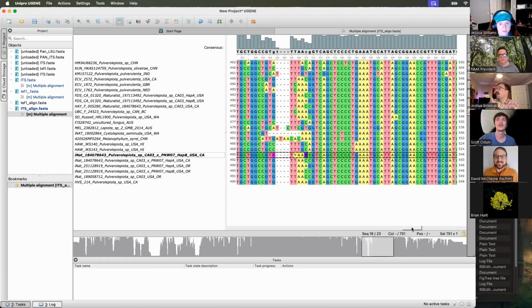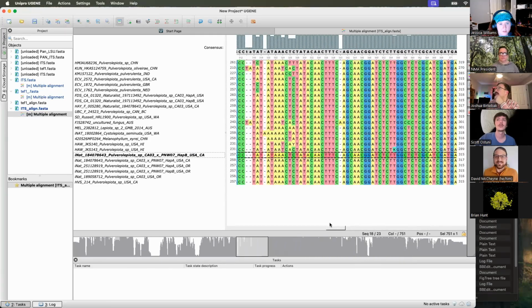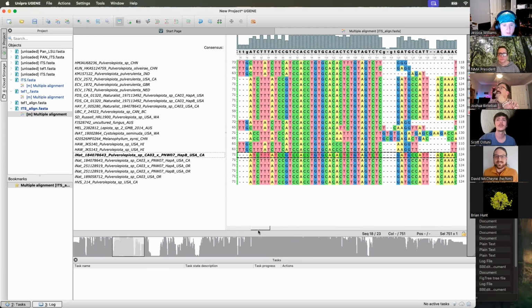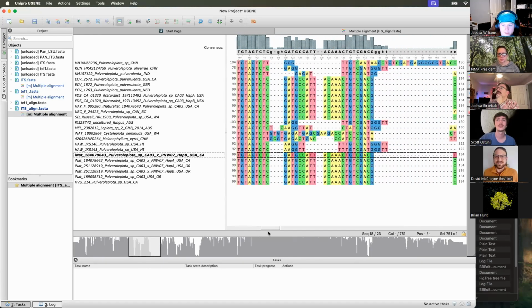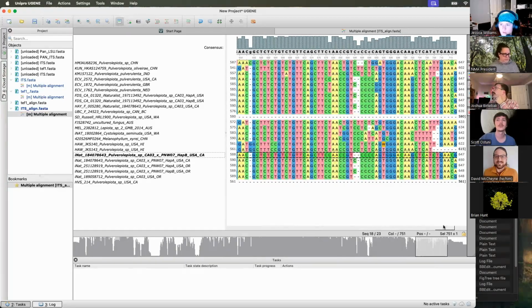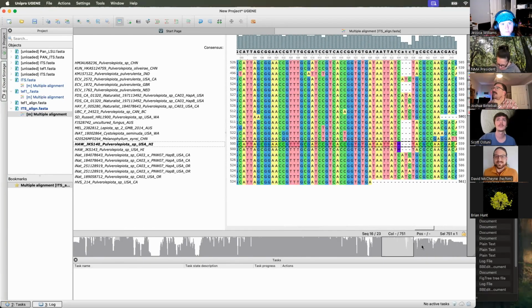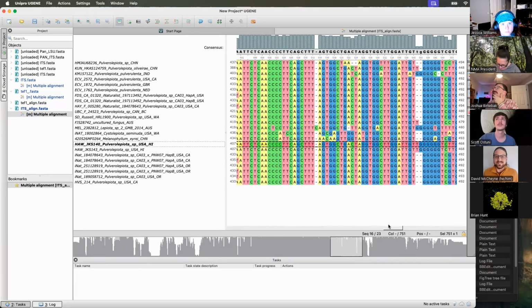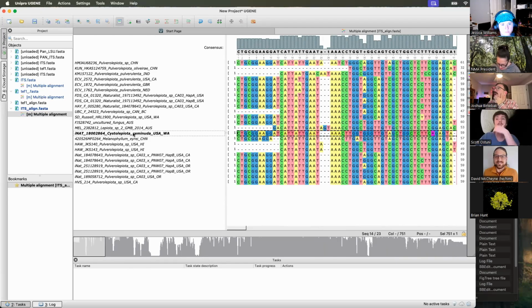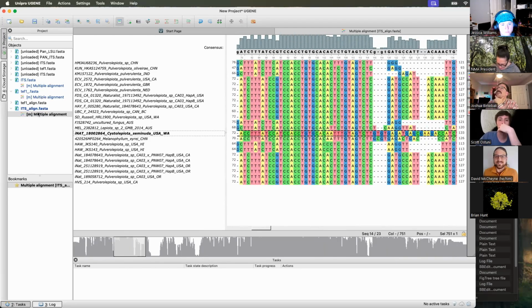This is different from the other sort of haplotype signal we were seeing. So maybe we'll go ahead and leave that in, because it's not where the other noise was. Let me check 78643 real quick, because I would have noted it. Yeah, otherwise the only polymorphisms I see are in Jeff Stallman's Hawaiian one, and our out group has one, which is fine. That's not going to influence this analysis.